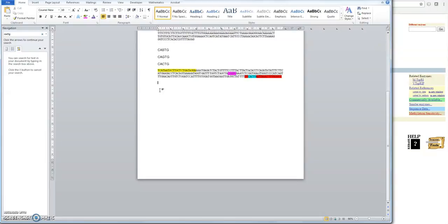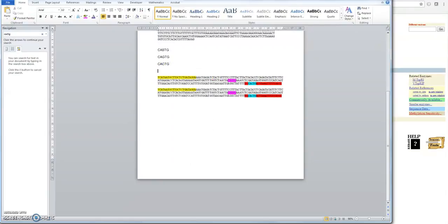So this is mutant BRAF. Okay, so it's going to be largely the same sequence. So I'm going to copy that and paste it there. And just make sure so we don't get confused, this is wild type, and this is mutant. So we know it's mutant in the cell line A375, and that contains a mutation of BRAF that we are looking for.